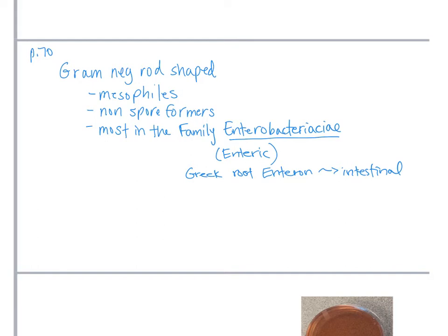So I'm not going to go through this list one by one like I did for our gram-positives. You'll notice just a mix of genera. We have a couple of Proteus organisms and a couple of Klebsiella, and just kind of a mix of a lot of different things. I would say what they have in common is I would call most of them opportunists. Or in other words, they're opportunistic pathogens.